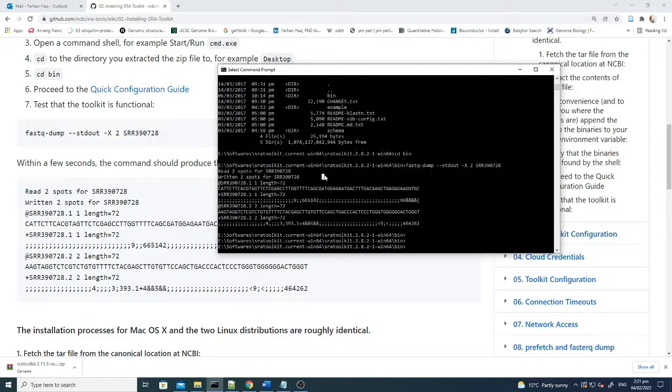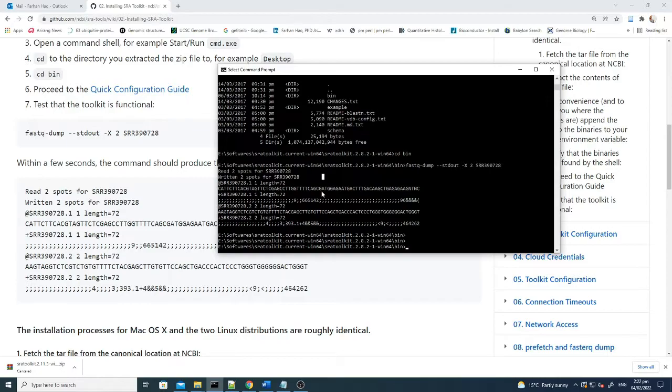The first thing you have to do here is install the SRA toolkit. In the next small tutorial, I'll explain how to download or access the SRR data from NCBI. First follow this and I'll get back to you with the next step. Bye bye.